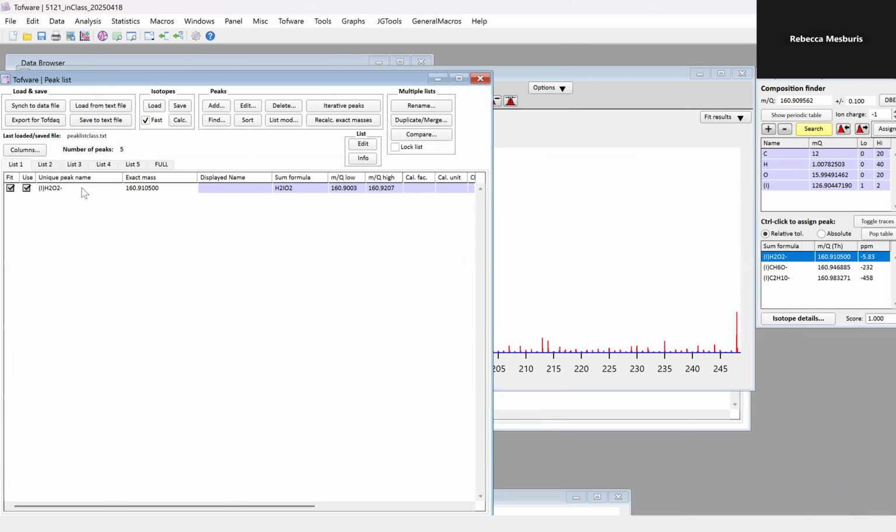Okay, great. Good luck. I definitely encourage you to explore this step and the different options and tools up here because there's a lot to learn and I can't cover it all in a quick 5-minute video.